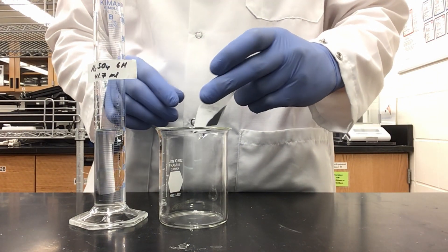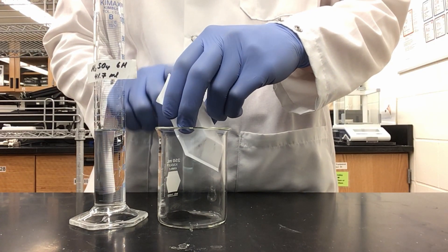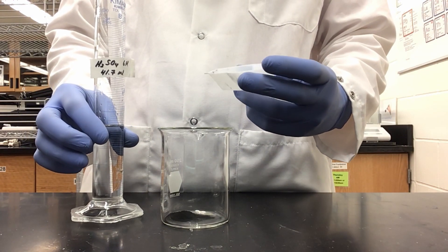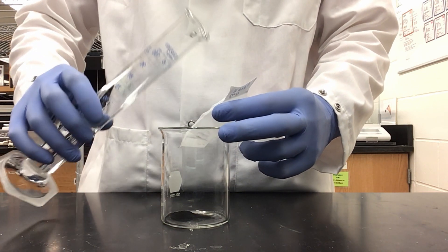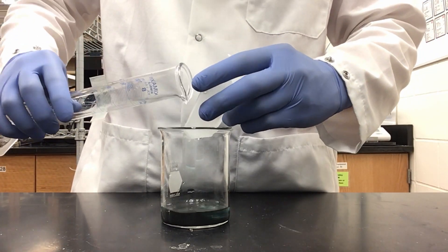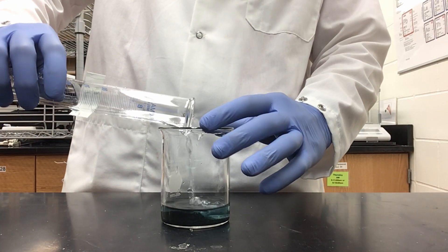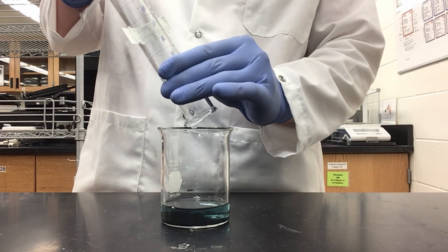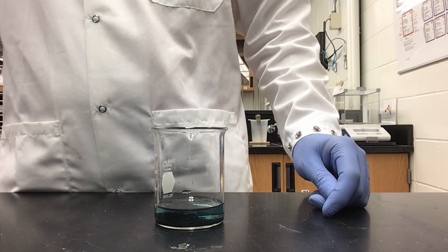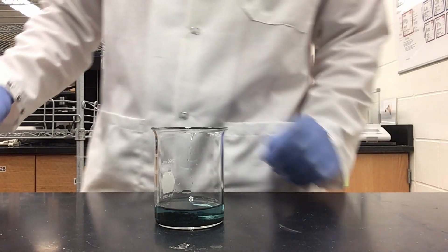Now I can add my copper oxide to my beaker. Then I am going to flush my weigh boat with sulfuric acid to make sure I get all of the copper oxide. Now I have gotten all of the copper oxide out of my weigh boat, so I will add the last of my sulfuric acid. To speed up the reaction, I am going to add glass beads — you will have glass beads provided in lab. I am going to add exactly 10 of them.